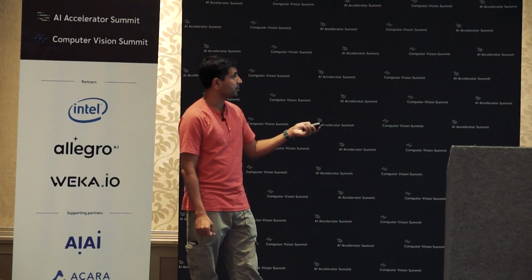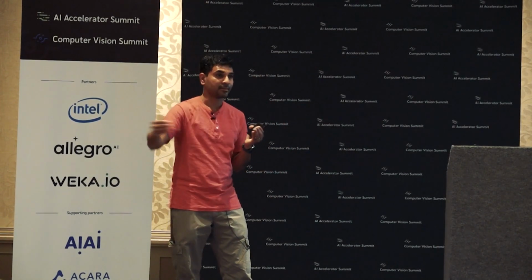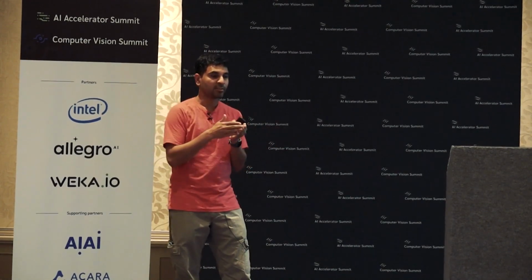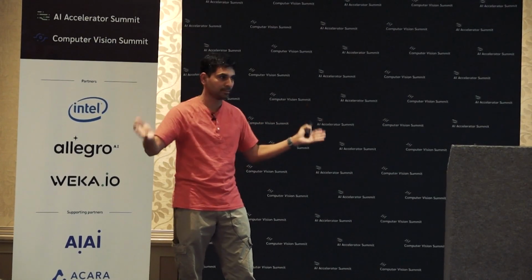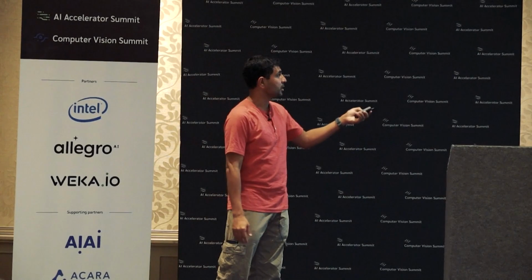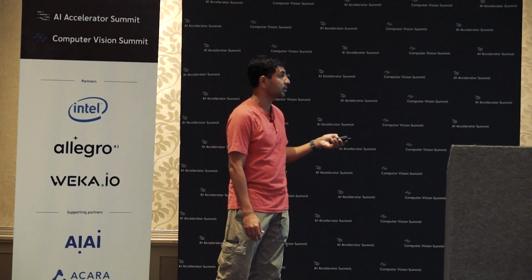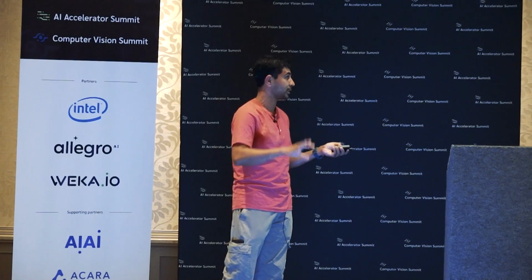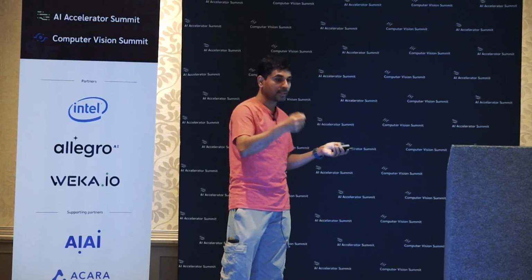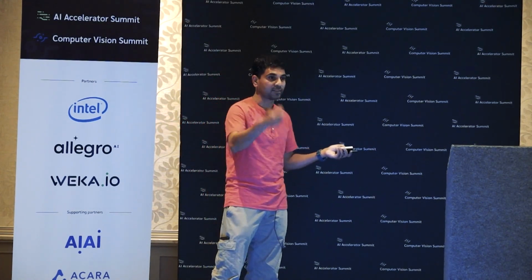And what we care about, this is a yeast cell, and this is called a budding yeast cell. The budding yeast cell keeps budding daughters, and the life of a budding yeast cell is not measured in chronological time. It's measured in the number of buds it produces. So the cell typically produces like 20 buds and dies, or something like that. So this machine is an automated way of, I'm not showing an animation here, but essentially you can do a time-lapse video of this where the cells are budding in real time, and you can literally count, using something like a Mask R-CNN or some other machine vision model, how many times the cell is budding.